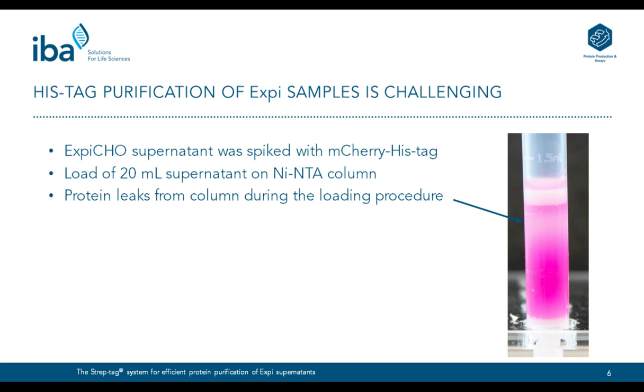So in this conference, we heard a lot about the Expi system, so this experiment might be very interesting, because here we see what happens if you load Expi supernatant without any further treatment on a common nickel NTA column. In this experiment, we spiked 20 milliliters of Expi supernatant with mCherry fused to a HIS tag and purified this 20 milliliters over a 1 milliliter nickel NTA column.